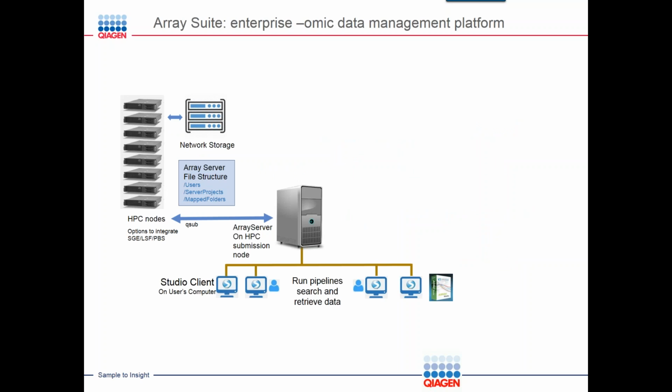Array Suite, I think most of our customers have both Array Studio and Array Server, and we call it Array Suite. It is an enterprise omics data management platform. The user works on the client at this stage, mostly on desktop, sometimes on Mac desktop, but hopefully soon on web browser as well. And there's always a server behind this. This is called Array Server.